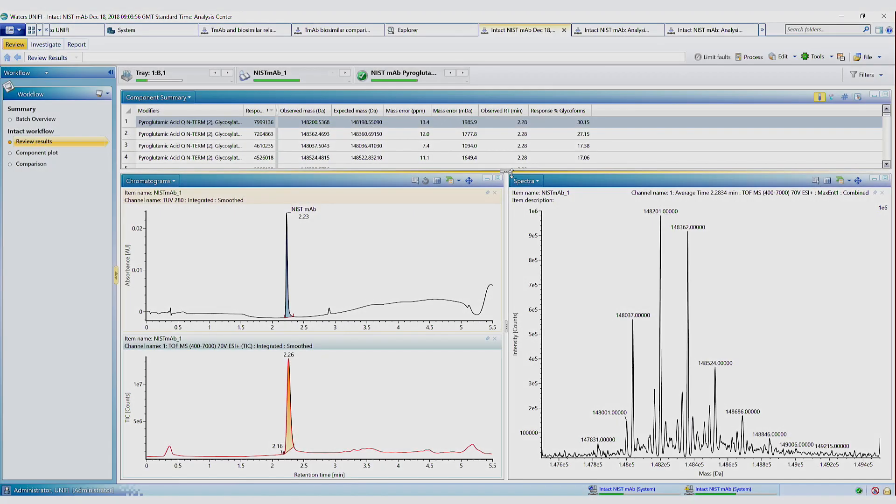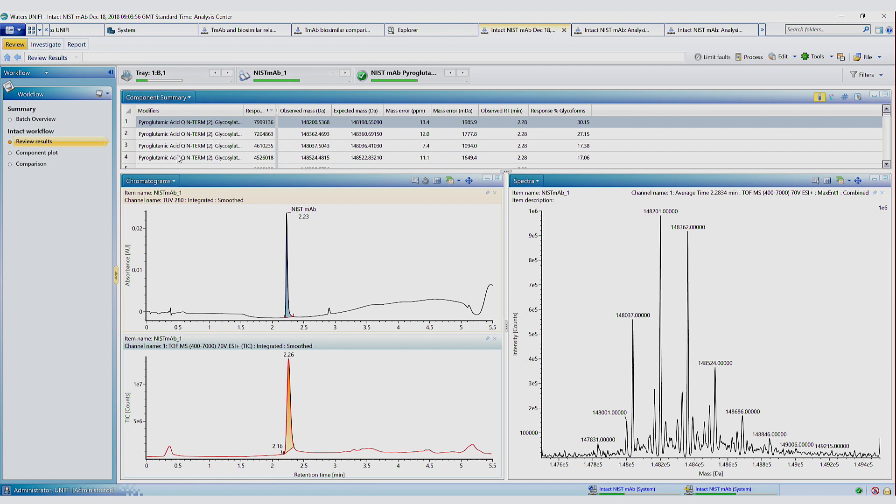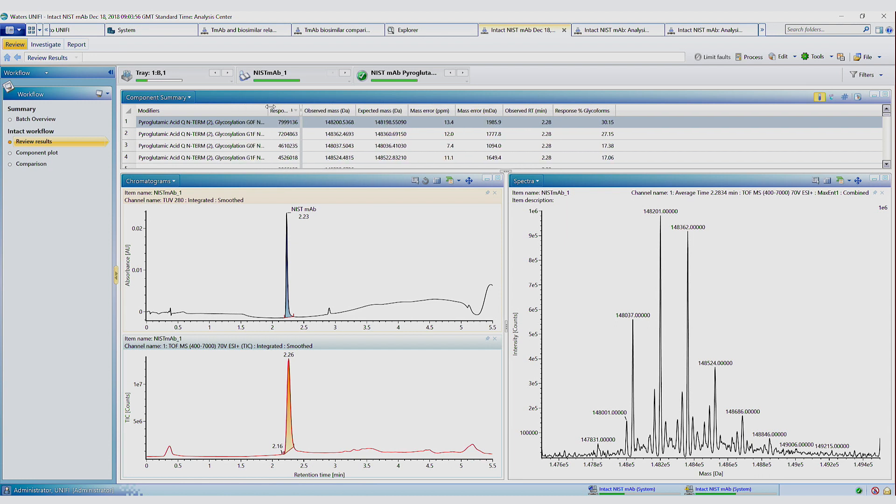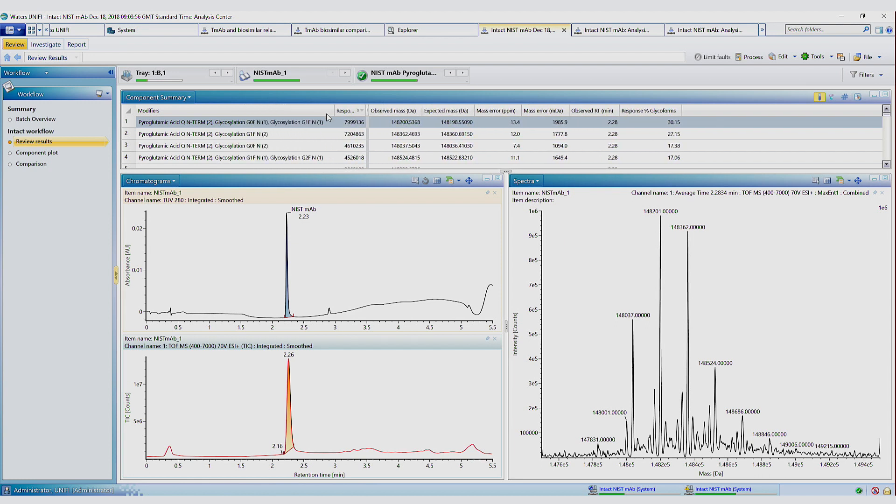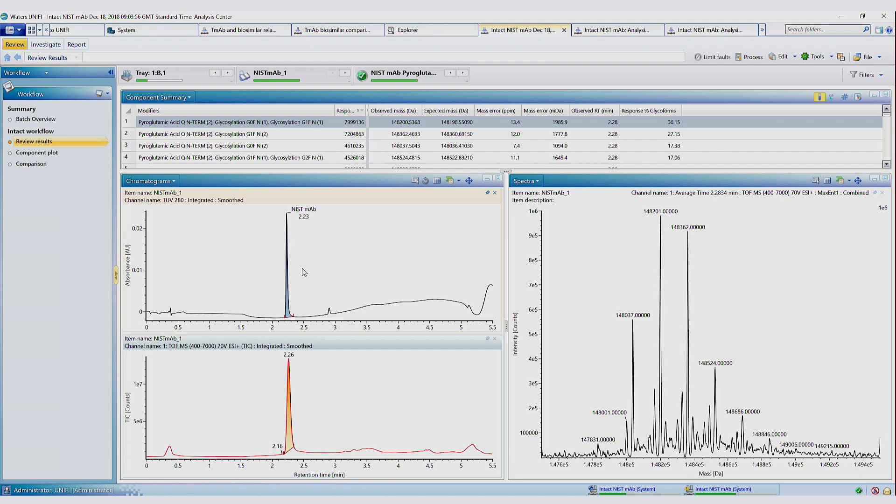So now we have the results from that intact acquisition. So the data has been processed. So in the component summary table, we can see we've identified the major glycoforms and we have a percentage which corresponds to the ratios of these glycoforms. We've got the integrated UV and TIC chromatograms, and over here we have the deconvoluted spectrum.